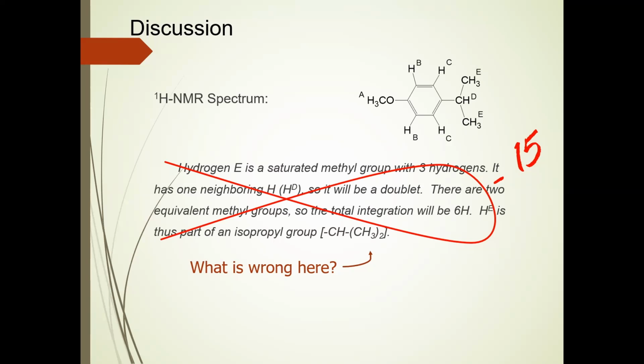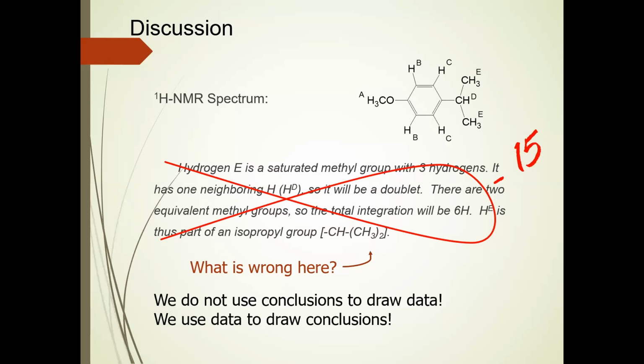Go from the spectrum, draw a conclusion. How does this correlate to the structure? Never start with your structure, because then you're going from conclusion to data, and we simply don't go that way. That's backwards.